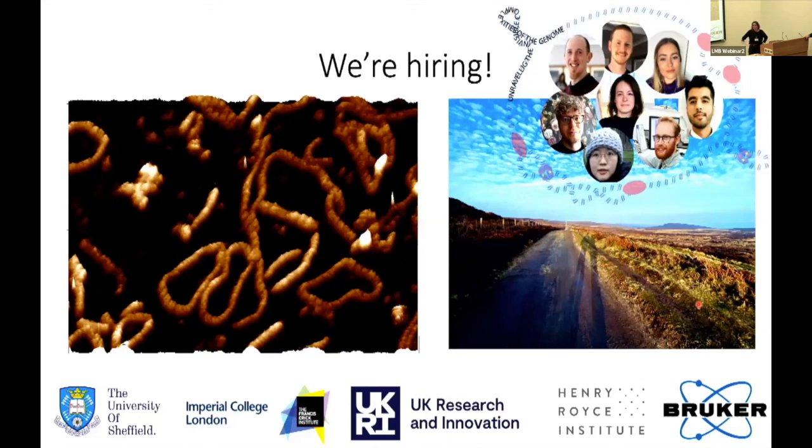I think we come to a pressure problem. If we make things very, very thin, then we have to improve a lot of the resolution of our whole detection systems to compensate for the fact that we're turning a sharp probe into a needle, and we're poking biological soft objects with a needle. I think the big steps forwards here are in application of machine learning and better image analysis techniques to the data we have, rather than in hardware improvements, or that's at least where we're heading with this.